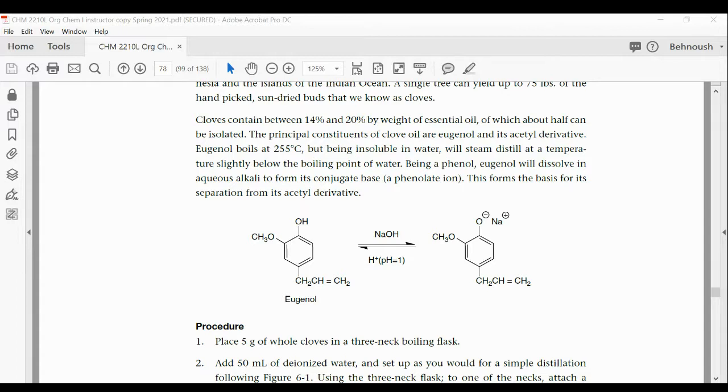So we are going to do the test for unsaturation, the double bond, and the test for the phenol to confirm that we have the product. So it's like a qualitative analysis. That analysis can go into a data table, just like the first experiment you did for solubility.